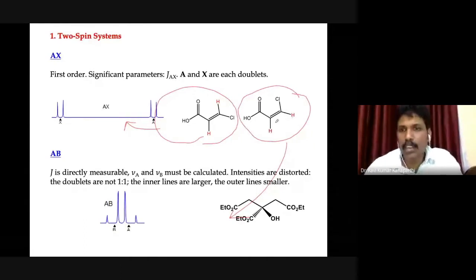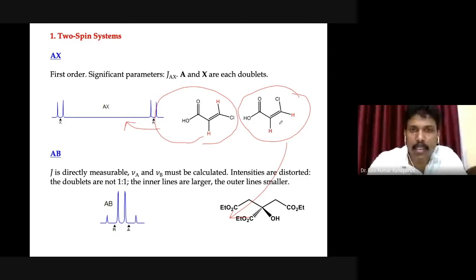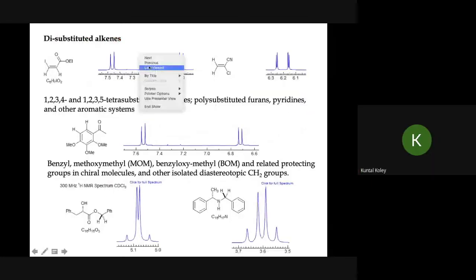Maybe this vicinal, this cis protons coupling. When you just see, okay, this will couple with this, and this will couple with this. So this is a doublet, and this is a doublet. Both will merge together, so probably that becomes an AB system. Like in this case, sir, here also. Of the cis, it should be far apart according to this iodo compound.